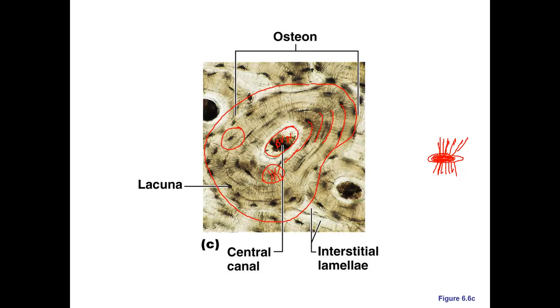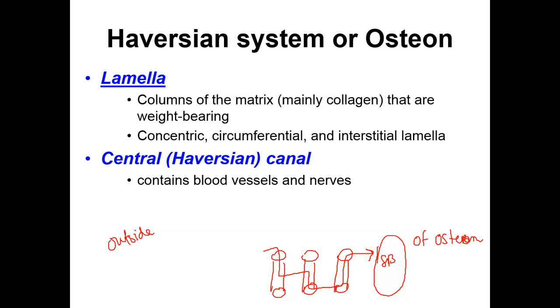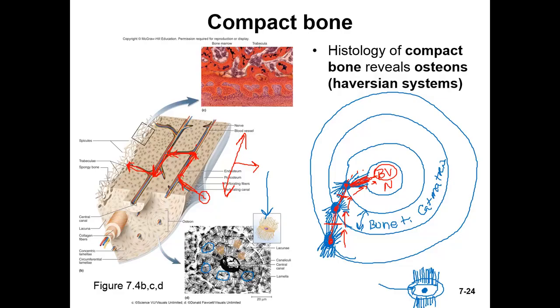Okay, so that's a smaller picture of it. And then on a bigger scale, when you go back here and look now, this is where you can see the entire osteon and then how they are interconnected with the Volkmann's canals. All right, let's see how this does.